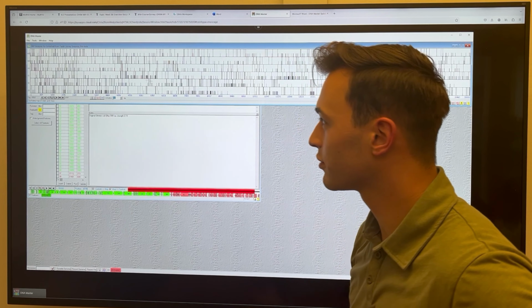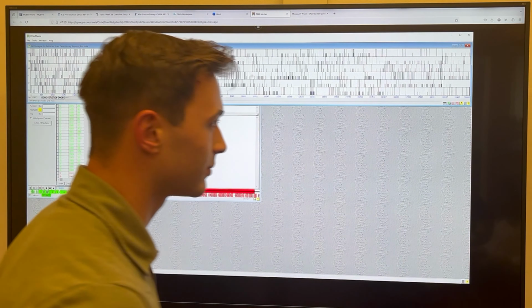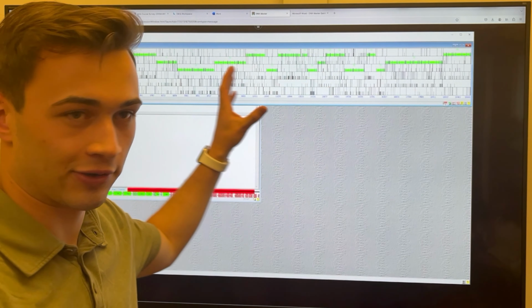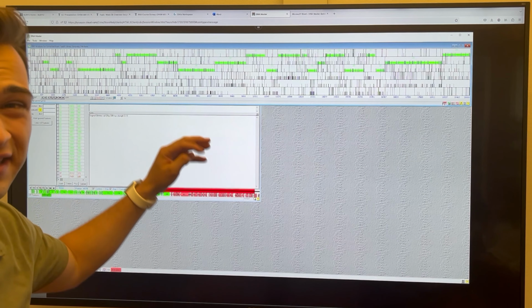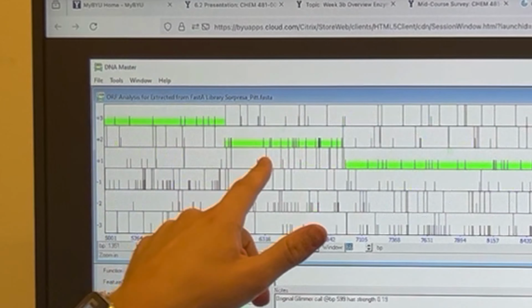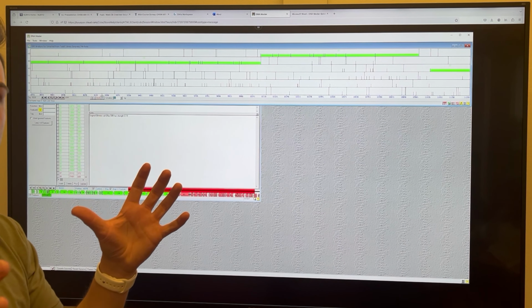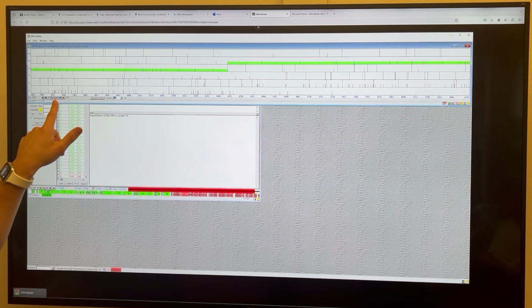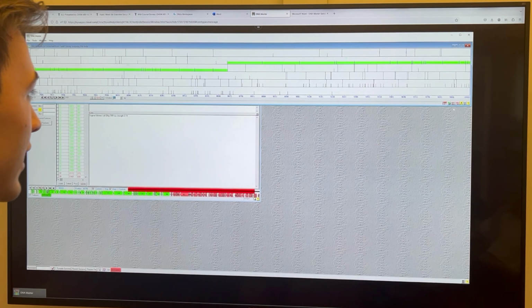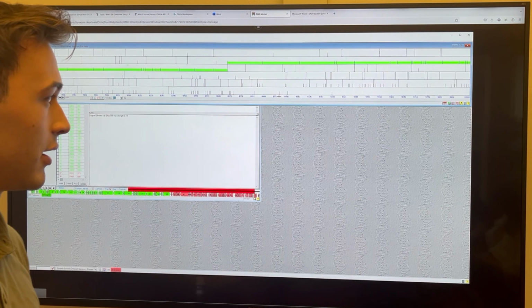And so here you can see you have your whole genome outlined, and you don't really see anything because you've got to click over here on ORFs, and then it'll pull up all of the ORFs in your genome. It's really hard to tell from this video, but each one has a number. You should see 1, 2, 3, 4. Some of them will overlap each other, and you can adjust the length and size here on the left using these toggles, and you can adjust which point in the genome you're looking at, which will be helpful when you're looking at ORFs that are later downstream within the genome.